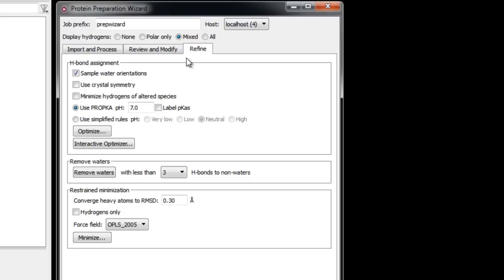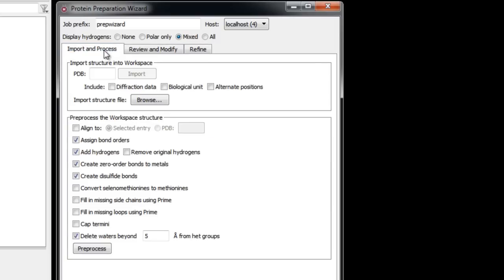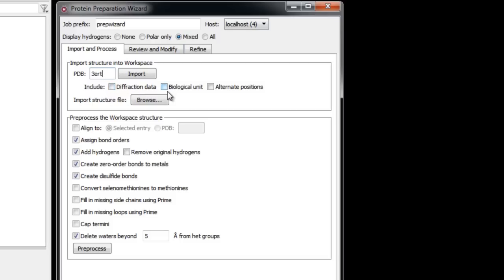For an unprocessed protein such as one from the PDB you should run through all three stages. For this example we're going to use 3ERT. Note the options available on import, including diffraction data (useful for checking or refining with Prime X), the biological unit (merges all structures into a single entry), and alternate positions of atoms in the PDB file. Note that these options are performed using the RCSB website so internet access is required. Here we won't use any of these options so we'll just click Import.